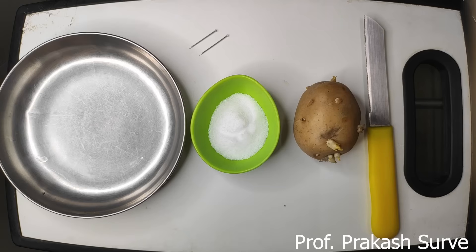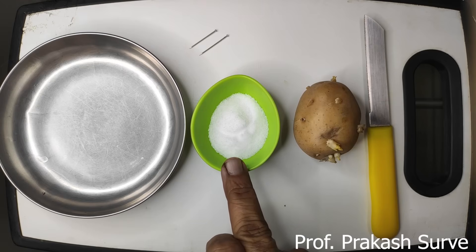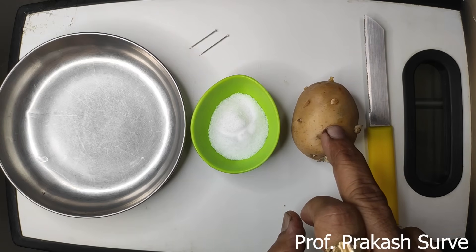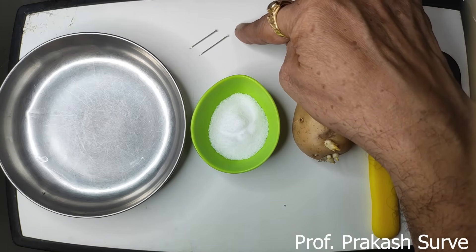Welcome dear student. Today we'll see about osmosis using the potato osmoscope. There are very easy steps and within a short period of time you can do the osmosis using the potato osmoscope. The requirements are: one plate or petri dish, salt for making the hypertonic solution, a medium-size potato, a knife or scalpel, and two pins to find out the level of the water inside.